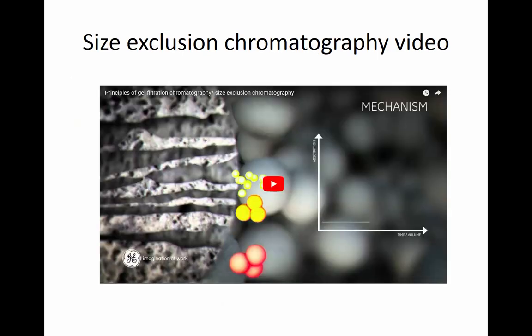And let's look at, again, I hope the sound is sufficient. If it's not, I plan on posting these online. So here, let's look at the size exclusion chromatography video right here.